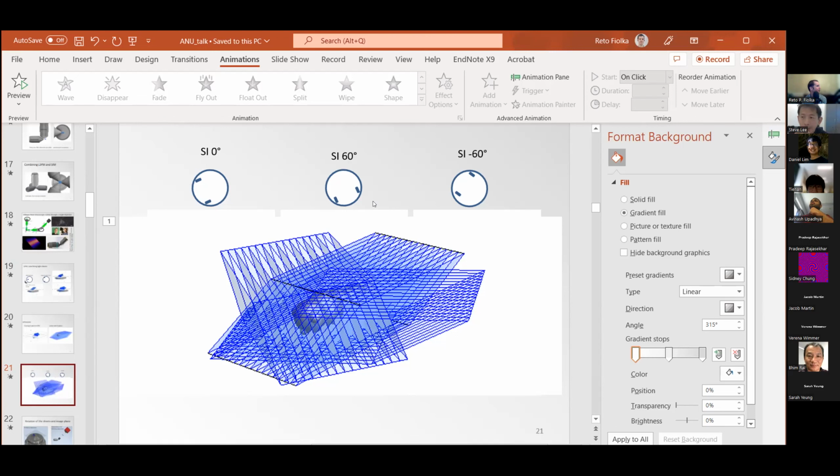But we figured out some sort of alignment protocol. We treat the image rotator as a separate module that you can take out and put on a separate optical table, and place some pinholes a meter away on each side and align so that a beam that goes straight in doesn't deviate by much over, say, a meter of propagation. That way we dial it in to have a very small angular error. And then it works, at least in our hands. So the beams don't disappear or, in one direction, all of a sudden change the tilt. If they moved a bit inward, then the plane would be differently tilted, and we can observe with some test samples that the waist of the light sheet stays where it should be and doesn't tilt relative to the tertiary.